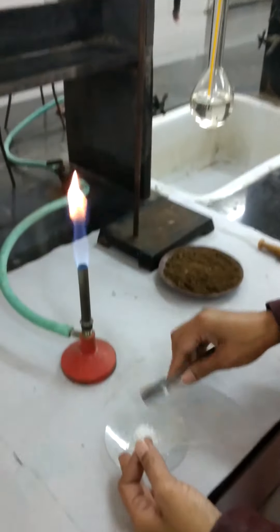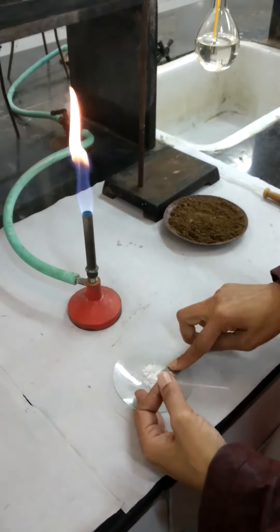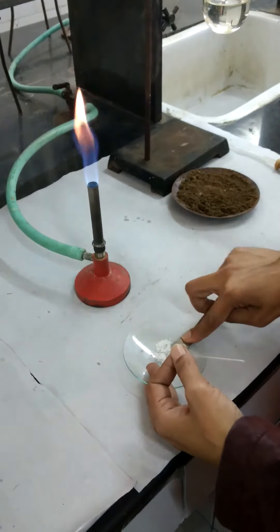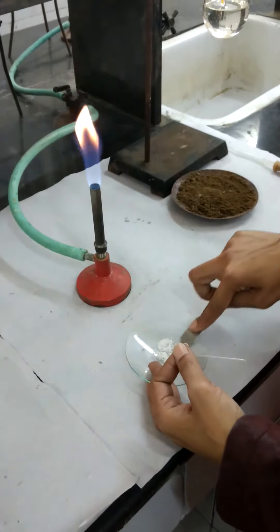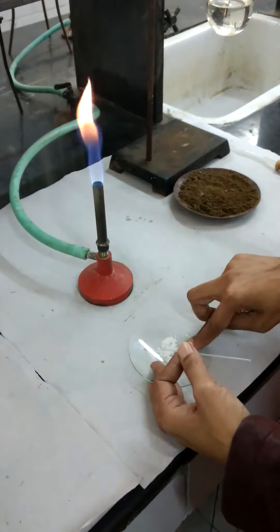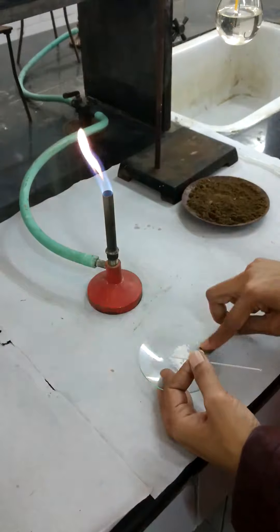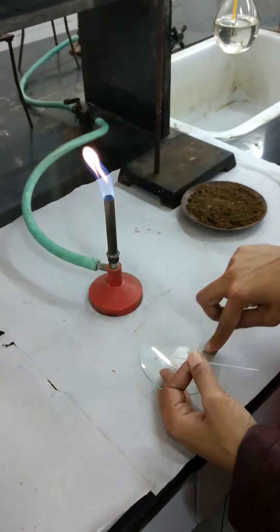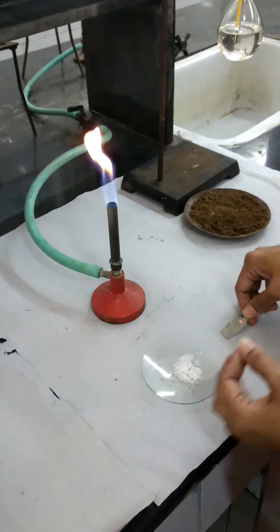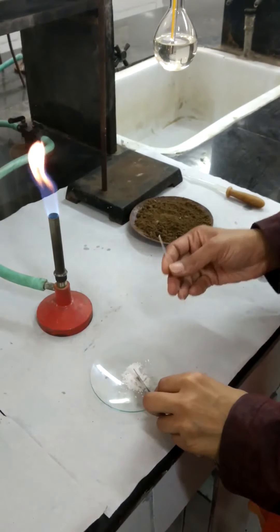Now we will fill this organic compound in this capillary tube. Before trying to fill in this compound, crush it using the help of a spatula. That gives more compact filling in the capillary. With the help of the spatula, fill this compound and tap it.